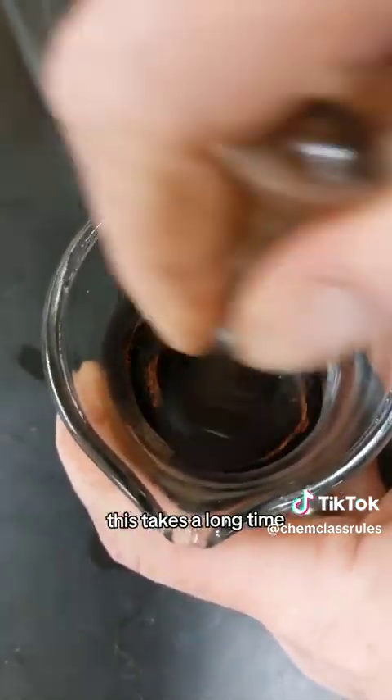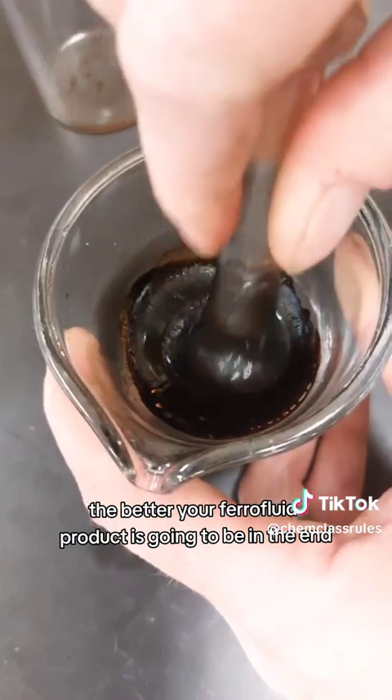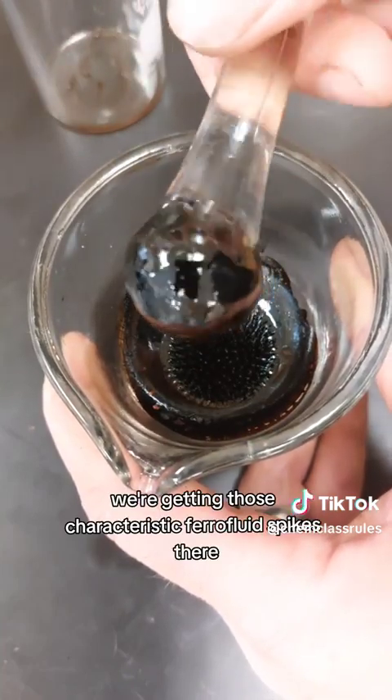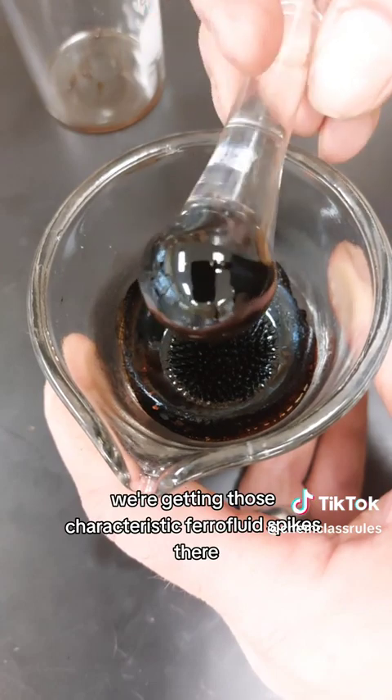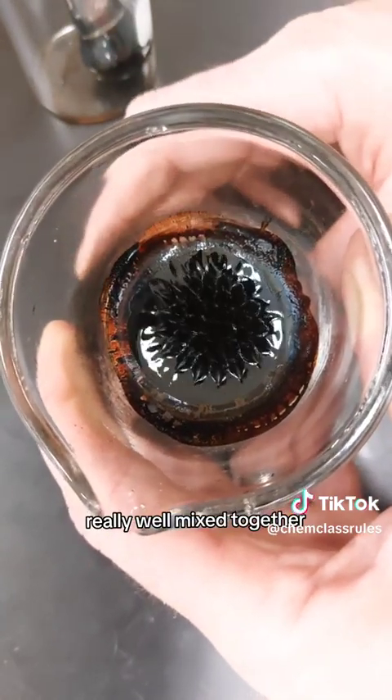Now this takes a long time. The more that you grind it together, the better your ferrofluid product is going to be in the end. As you can see, we're getting those characteristic ferrofluid spikes there in the bottom now that we've got everything really well mixed together.